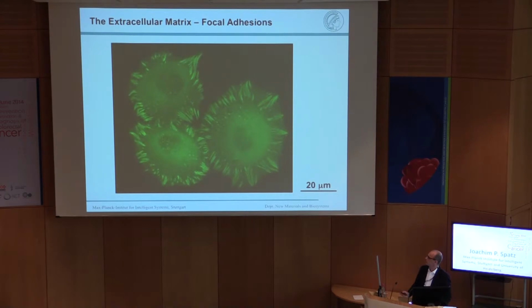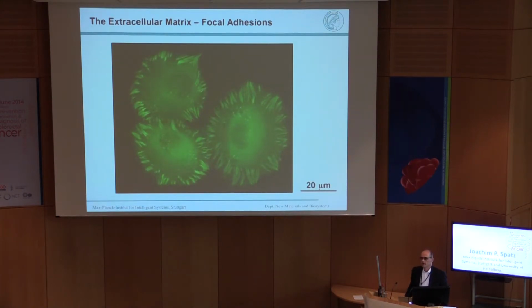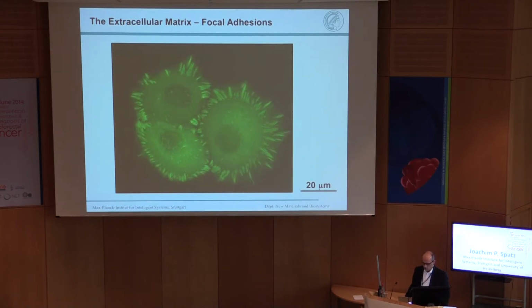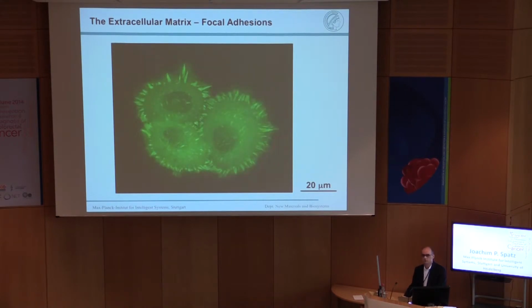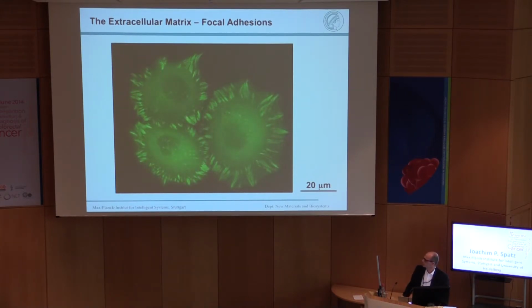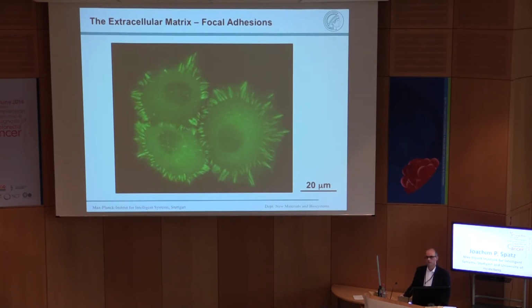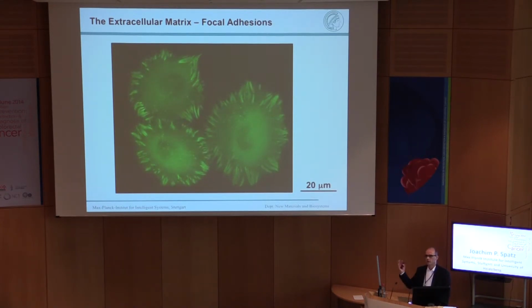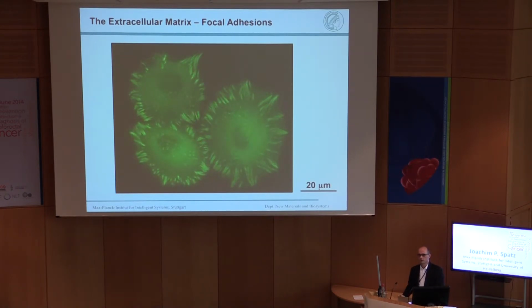If you look at tissue cells, these are standard fibroblast cells adhering to interfaces. We marked here vinculin, a protein of the focal adhesion cluster. By looking at these adhesion processes, here still marked with a fluorescent molecule so that you can identify the adhesion sites, you can ask whether you can track some features very specific for a certain phenotype, and maybe even do this marker-free. So it should be quick and it should be marker-free.